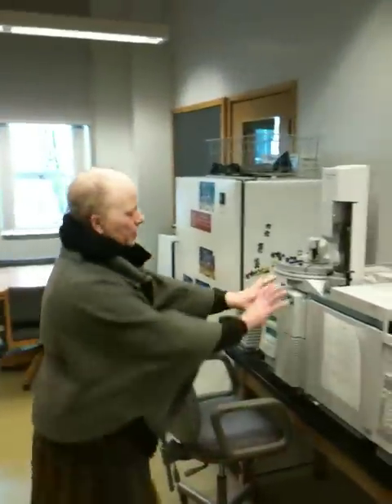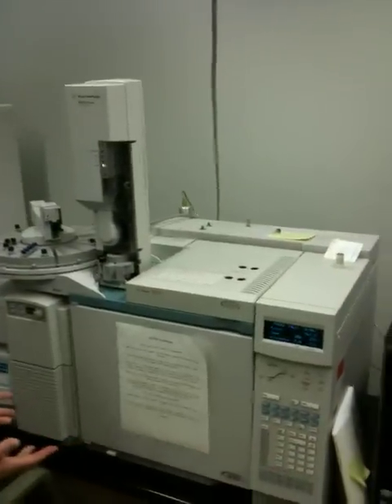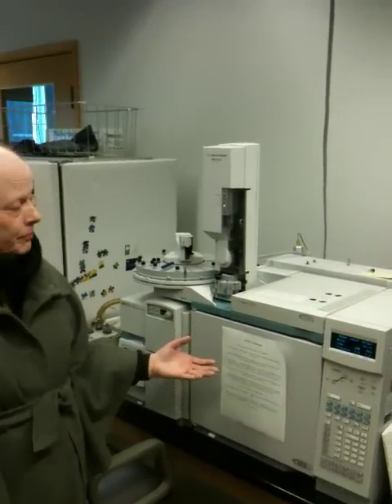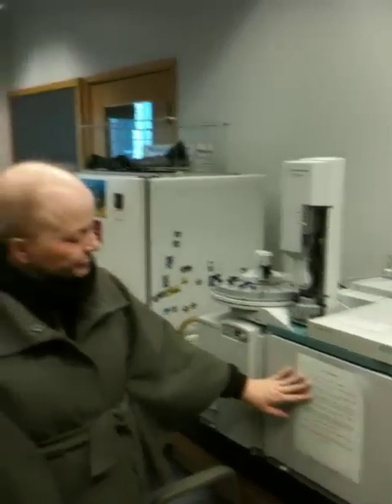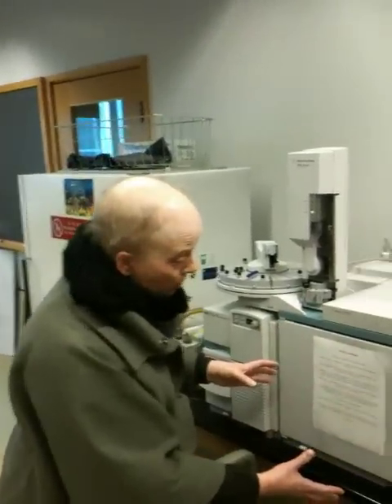This part right here is the gas chromatograph, and it's really not very different from the gas chromatograph that you use downstairs, in that it contains a column. You inject your samples into the column and your compounds separate on that column. Now, this is really a big oven, and if I open it, I might get in trouble, but I'm going to open it.